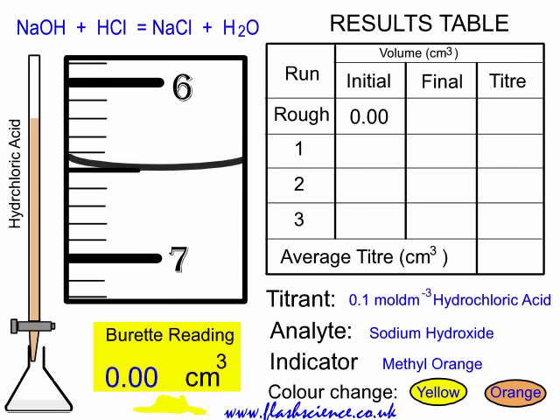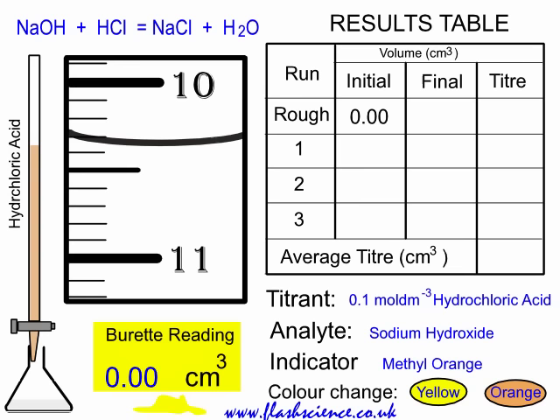This is a titration between a strong acid and a strong alkali, and most indicators will do. In this case, I'm using methyl orange. Methyl orange changes from a yellow colour in the alkali in the flask to an orange colour at the end point.